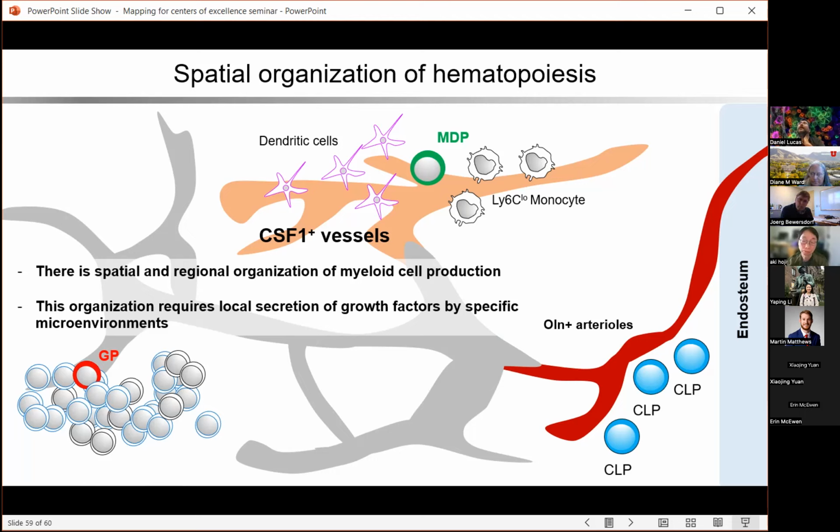And then the other problem that we had when we started doing that is that for good segmentation, you need 10 micron sections of the tissue, and generating 10 micron sections of the marrow is an immense technological challenge, compounded by the fact that you need to decalcify, which kills even more epitopes.